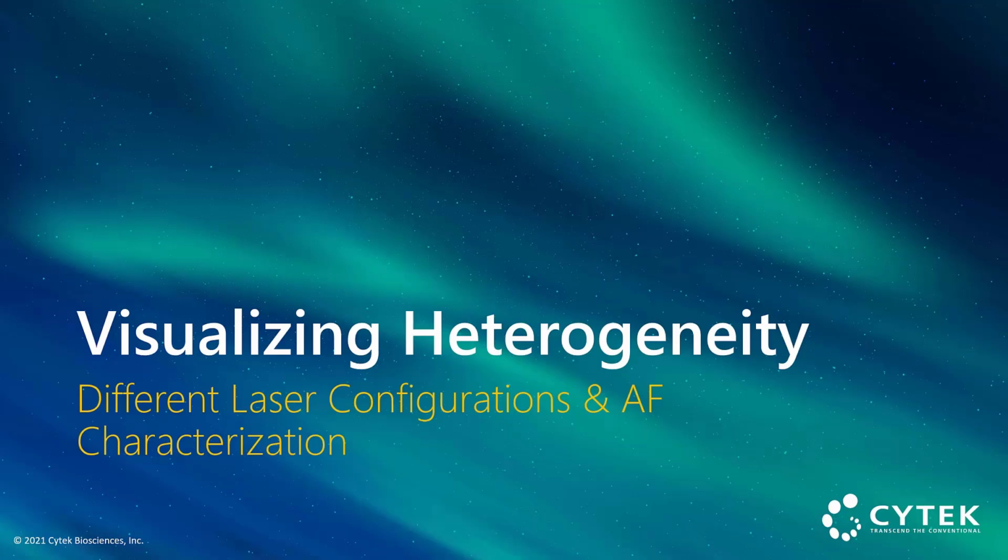So far, we have spent quite a while talking about the characteristics of autofluorescence in different tissue types. Now I want to help you find your own autofluorescence heterogeneity within your tissues, what you're going to look for, where you're going to look for it, and how these patterns change when you have different instrument configurations.